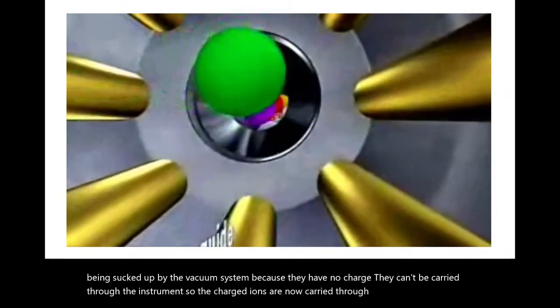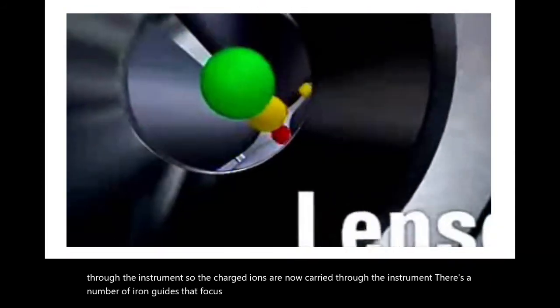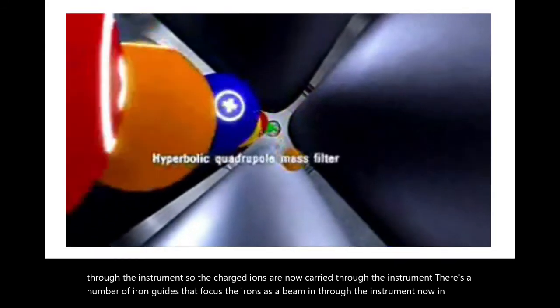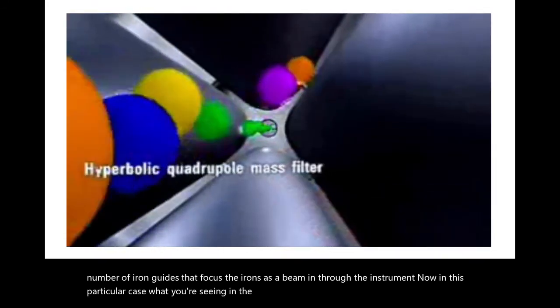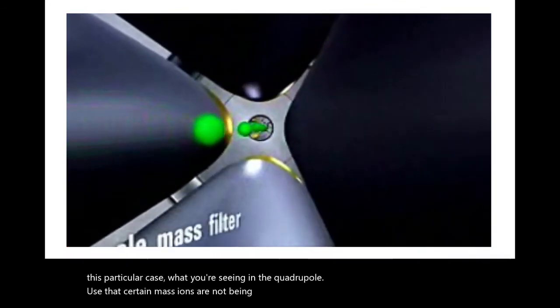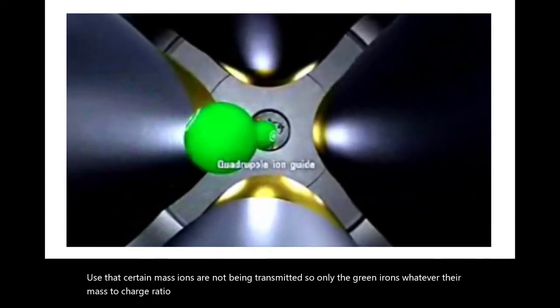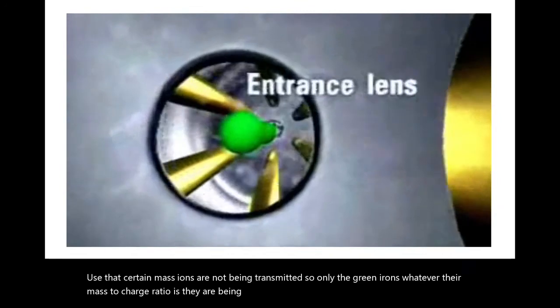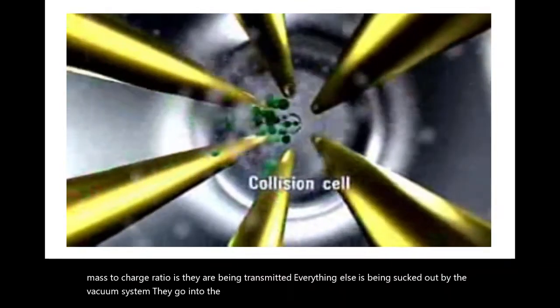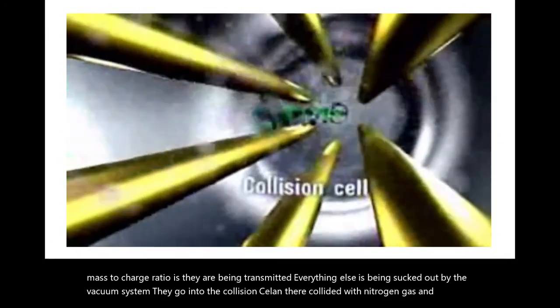There's a number of ion guides that focus the ions as a beam in through the instrument. Now, in this particular case, what you're seeing in the quadrupole is that certain mass ions are not being transmitted. So only the green ions, whatever their mass to charge ratio is, are being transmitted. Everything else is being sucked out by the vacuum system. They go into the collision cell and they're collided with nitrogen gas, and they're fragmented into their peptides.